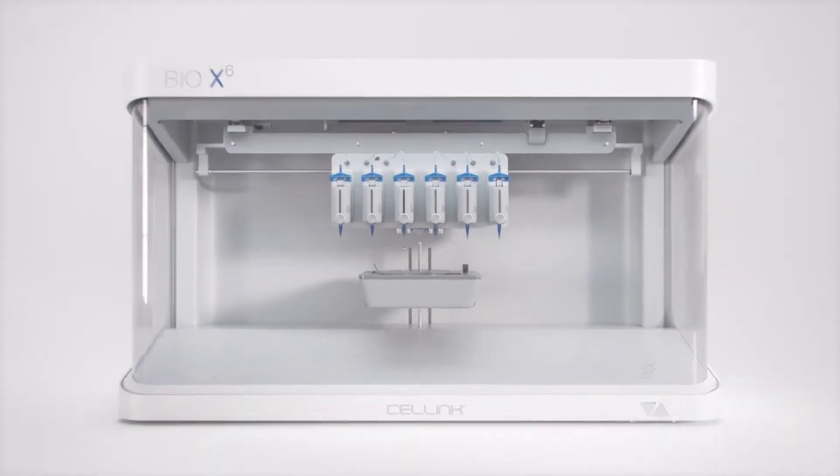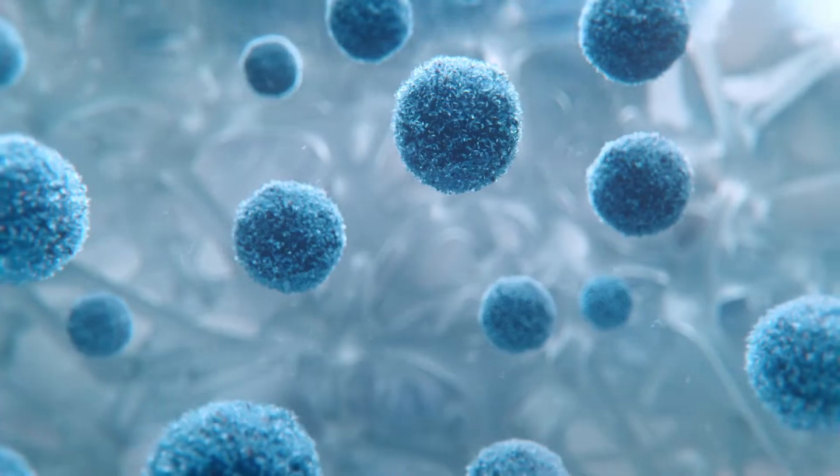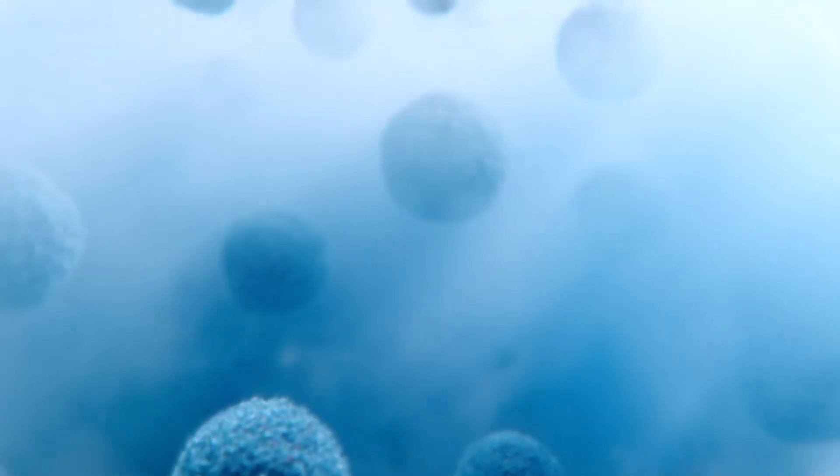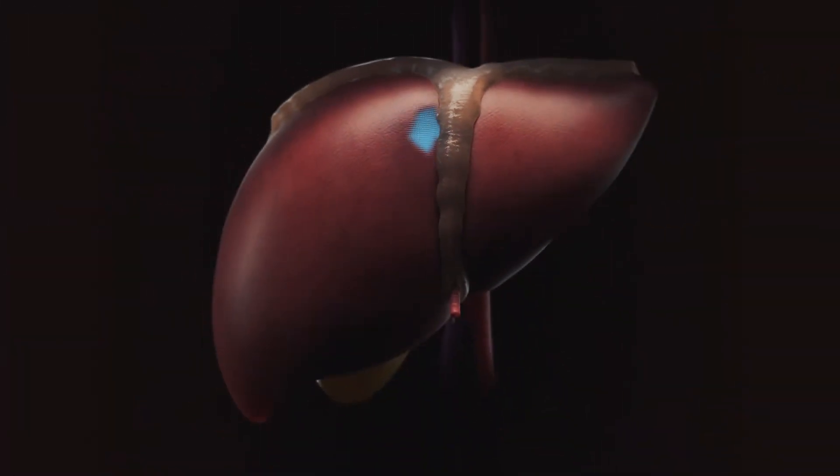The Bio X6 is a product of CellLink's bioconvergence technology. Bioconvergence integrates the latest technological and scientific advancements with biology, saving countless lives and advancing medical science above and beyond our current limitations.